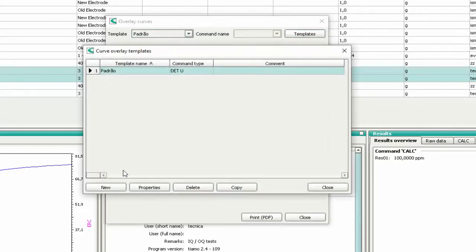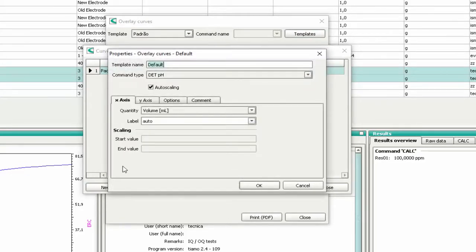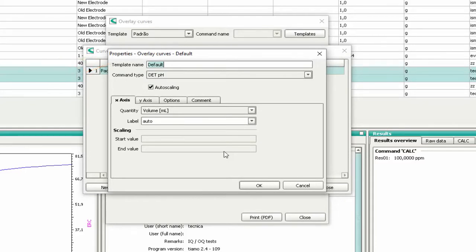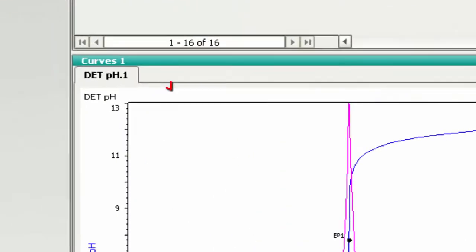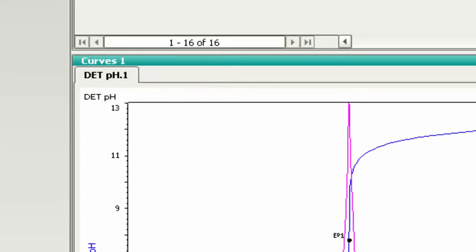Press the button New. Give a name to the template. Choose the titration type by selecting the command type used in the determination. If you don't know which one is your analysis, just look at the upper left side of the titration curve.